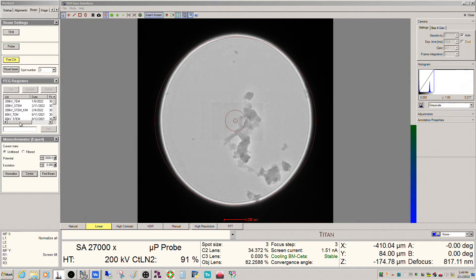That's how I use the FEG registers — I only use it basically to recall gun settings. The thing you have to understand if you have a monochromator with an X-FEG is that what's called the monochromator shift is going to vary very continuously, really over a matter of hours. So even if you save a FEG register, because of the monochromator shift, even if you go ahead and apply it, it's probably not going to give you a properly centered monochromator.